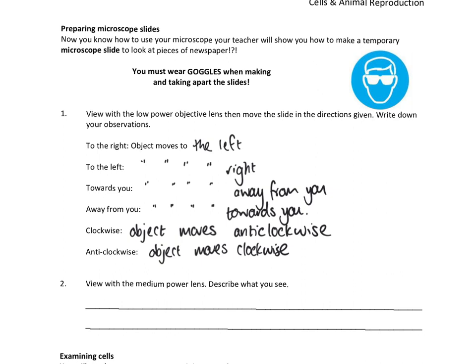Then it said view the image with a medium power lens. So if you remember taking, for example, our letter from the newspaper, we then viewed it using the medium power. What did we see then? Well, we saw the image more zoomed in. The letter appeared bigger, it appeared more magnified. So write something along those lines in your notes.